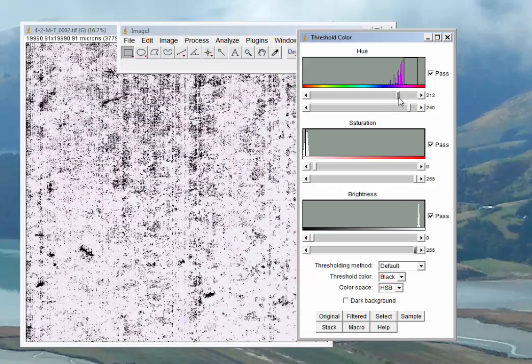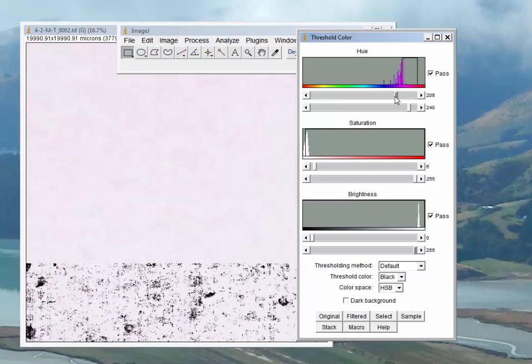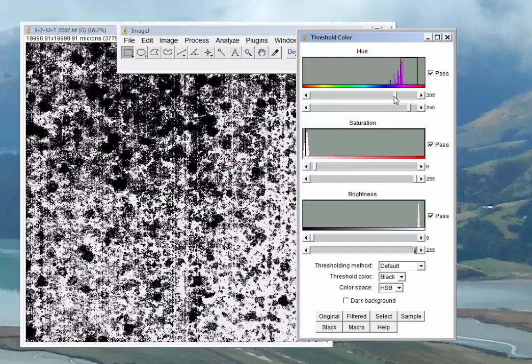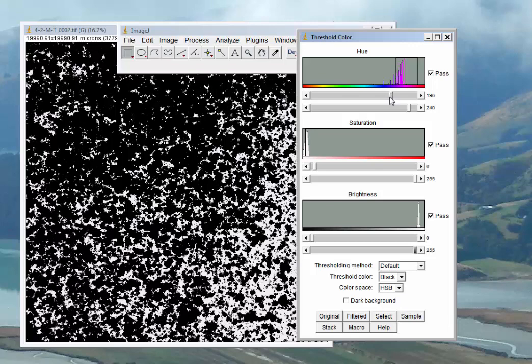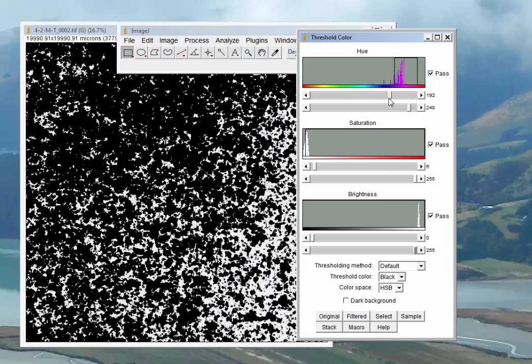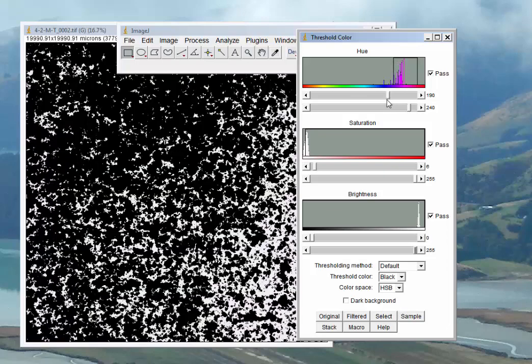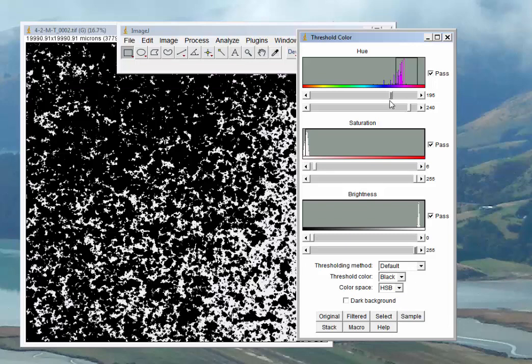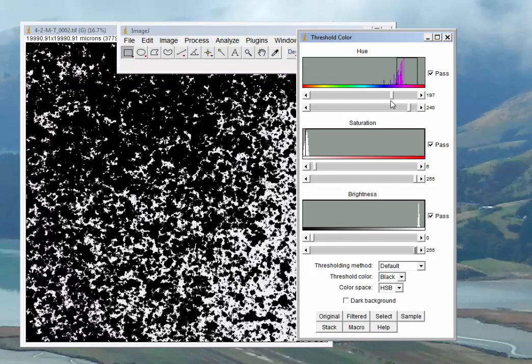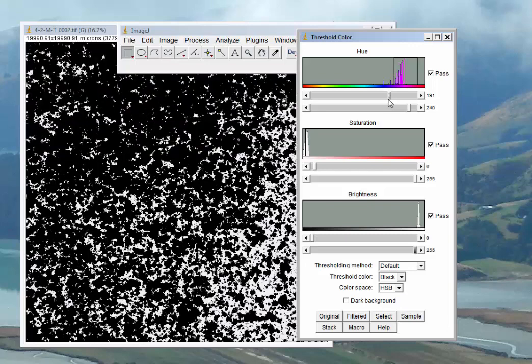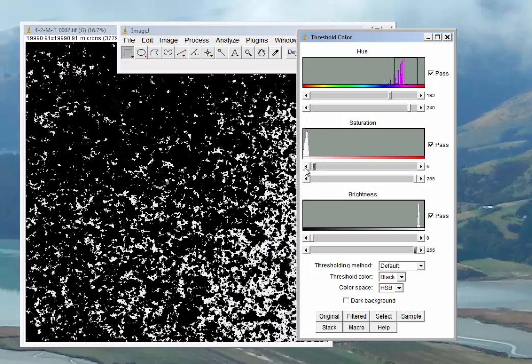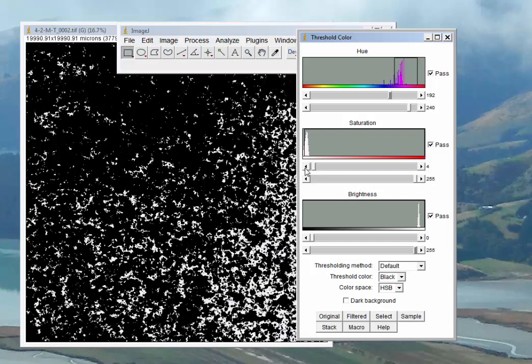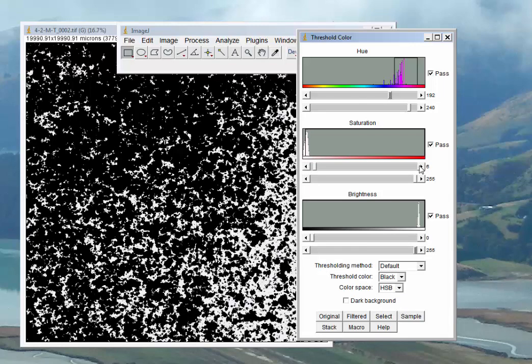As you slide over here, you can see there's pinkish color left all over in the background as we go through the different color range. This is a pretty inundated card. The big question here is where do the colors start and the contamination stop. We're going to make our best guess. On this card, I'm guessing that probably somewhere around 192 is the threshold between blue and magenta.